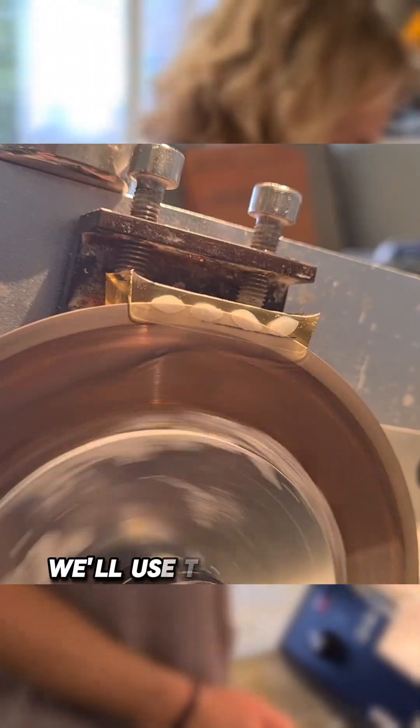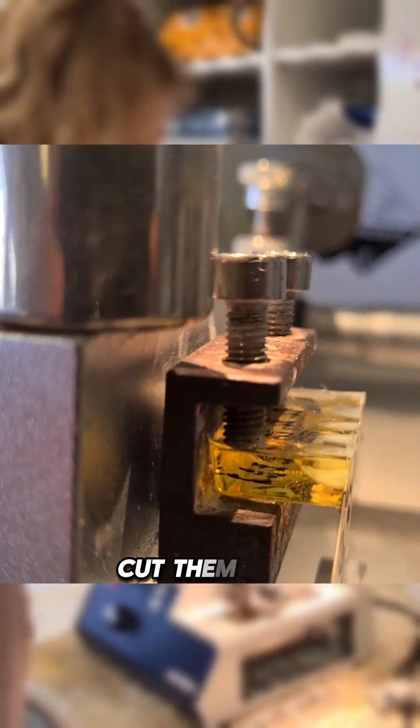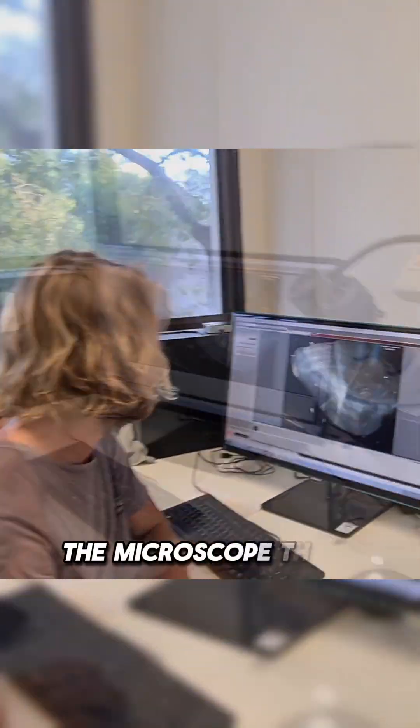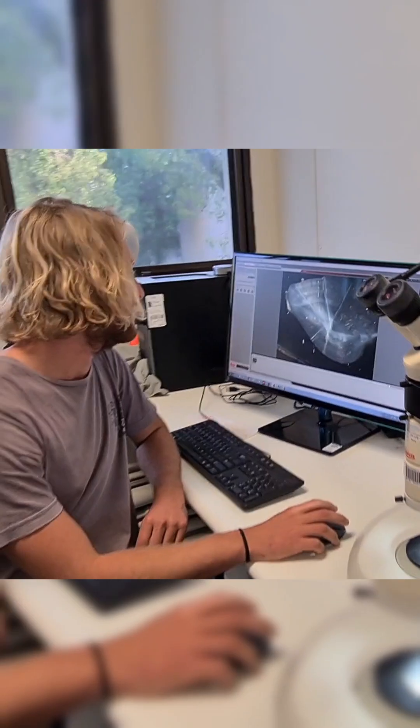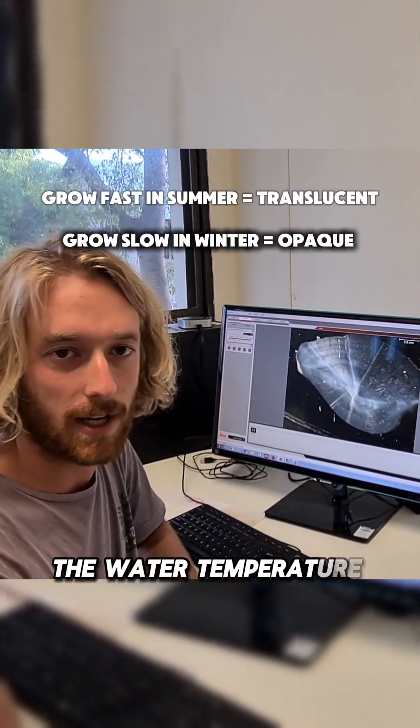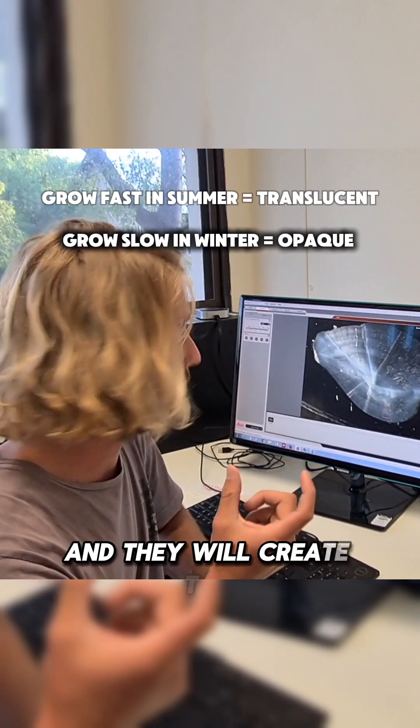We'll use this bone saw and cut them into 0.25 millimetres thick. We've got one on the computer under the microscope there. Each opaque zone is a seasonal growth — between summer and winter, the water temperature changes, and that creates this opaque zone.